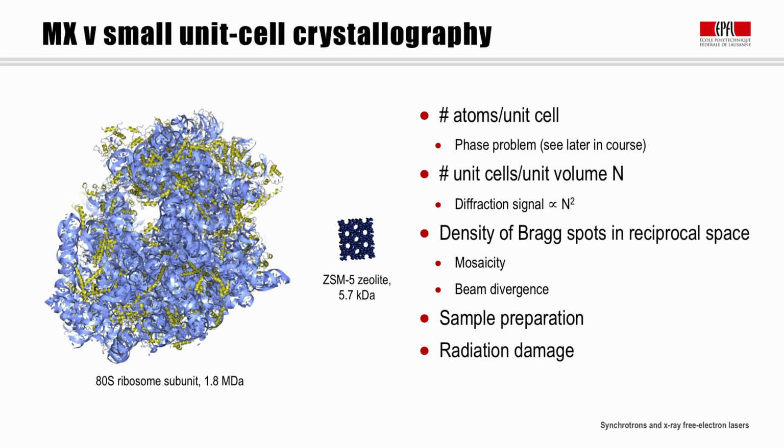The large unit cell dimensions also mean that the diffraction spots in macromolecular crystallography are separated by much smaller angles, and that many more diffraction peaks will lie on the Ewald sphere and thus be detected. For example, a protein crystal with a unit cell size of 200 angstroms irradiated with 12.7 keV X-rays will have angular separations of approximately 0.3 degrees. As many protein crystals exhibit a mosaicity of similar magnitudes to this angle, this can lead to overlapping signals.